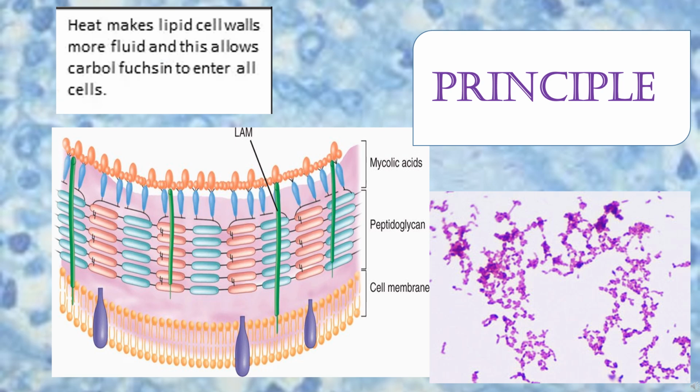The principle of the Ziehl-Neelsen staining is that the Ziehl-Neelsen stain uses basic fuchsin and phenol compounds to stain the cell wall of Mycobacterium species. Mycobacterium does not bind readily to simple stains, and therefore the use of heat along with carbol fuchsin and phenol allows penetration through the bacterial cell wall for visualization. The Mycobacterium cell wall has a lipid content made up of mycolic acid, making it waxy, hydrophobic, and impermeable. These are beta-hydroxycarboxylic acids made up of 90 carbon atoms that define the acid fastness of the bacteria.